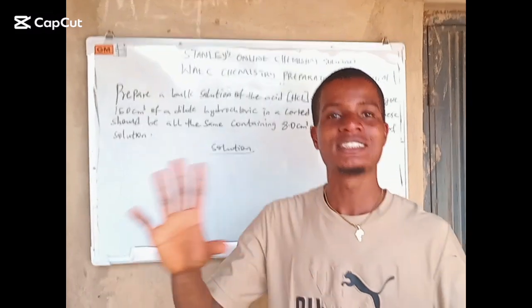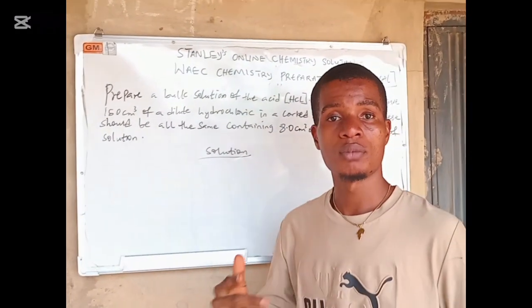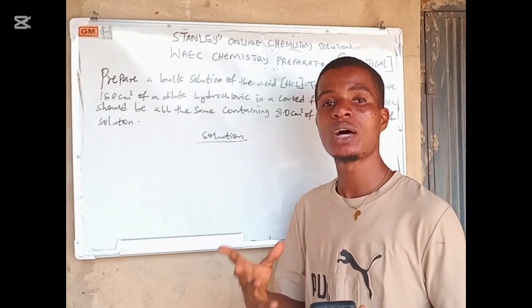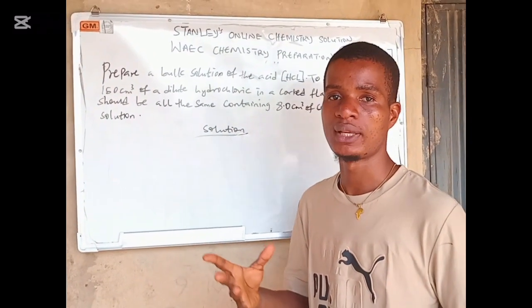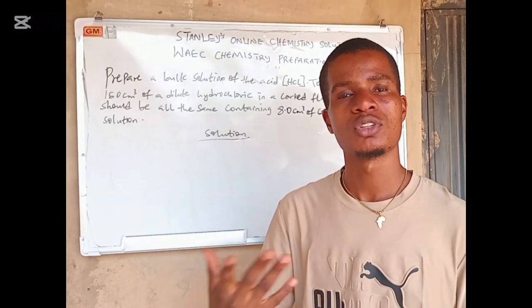Now, everywhere this is the season of WAEC, right? WAEC practical is tomorrow. Now, knowing how to prepare bulk solutions for WAEC acids and bases for the practical is a problem in some schools.